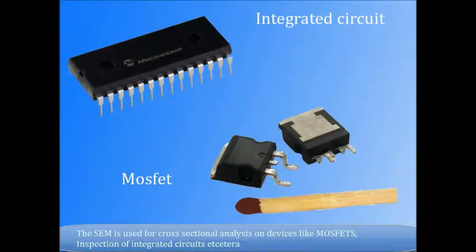The SEM is used for cross-sectional analysis on devices like MOSFETs, inspection of integrated circuits, etc.